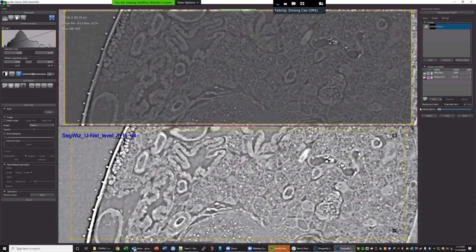But this milk gland is not very easy to detect, actually. It's a difficult tissue. I do have some other ones that might be easier. Yeah, I prefer to start with something easier, because visually this doesn't look very different from the other tissues. Yeah, it's tricky. Part of it is I have to follow it over multiple slices, for continuity's sake, because they're tubes.